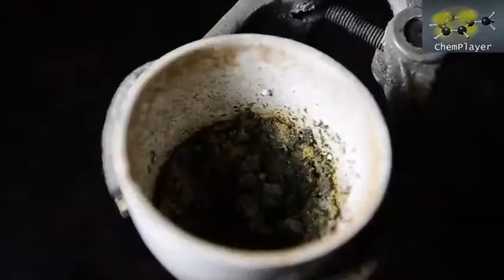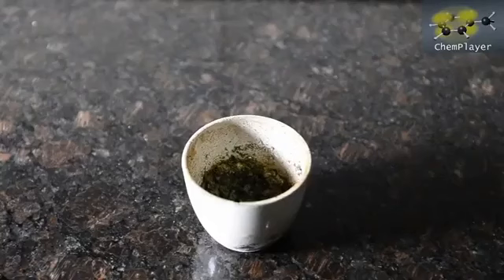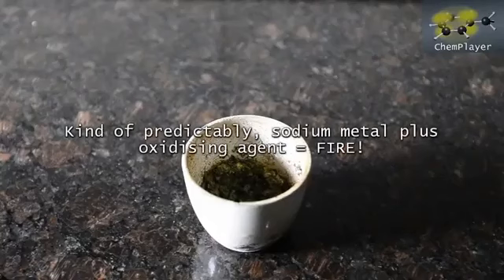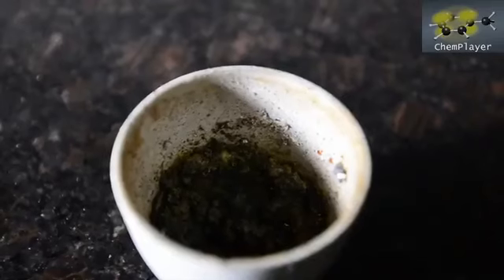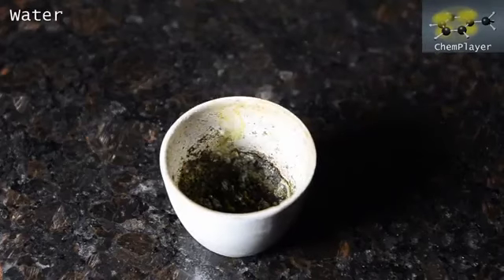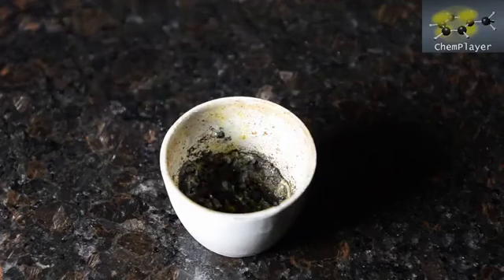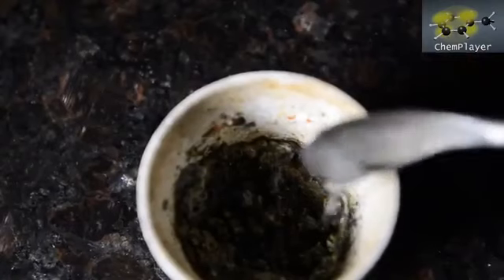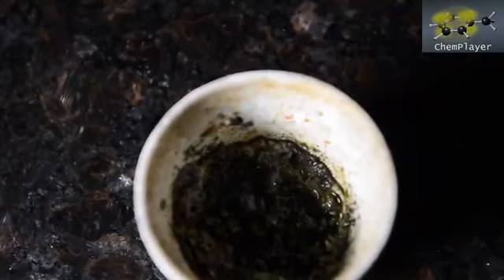Well, that didn't work out too well, did it? Sodium metal is a strong reducing agent. Ferrocyanide is an oxidizing agent. So it's kind of predictable, but at least it wasn't too violent. We let it cool and then add a few drops of water. Turns out that there's still quite a lot of sodium metal left in here as well. Dangerous, and not what we wanted to get from the reaction.